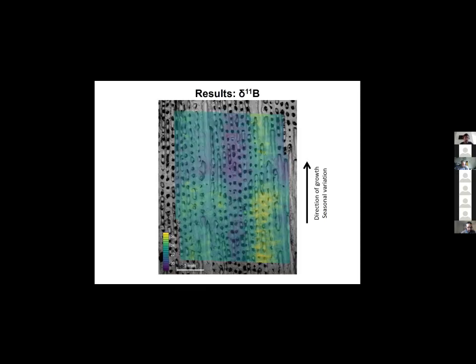And this structural relationship can be reinforced when we overlay it with an SEM image of where we've analyzed. So the lower values are in this more porous portion of the coral, in the columella, and the higher values are in the denser skeleton areas in the thecal walls.